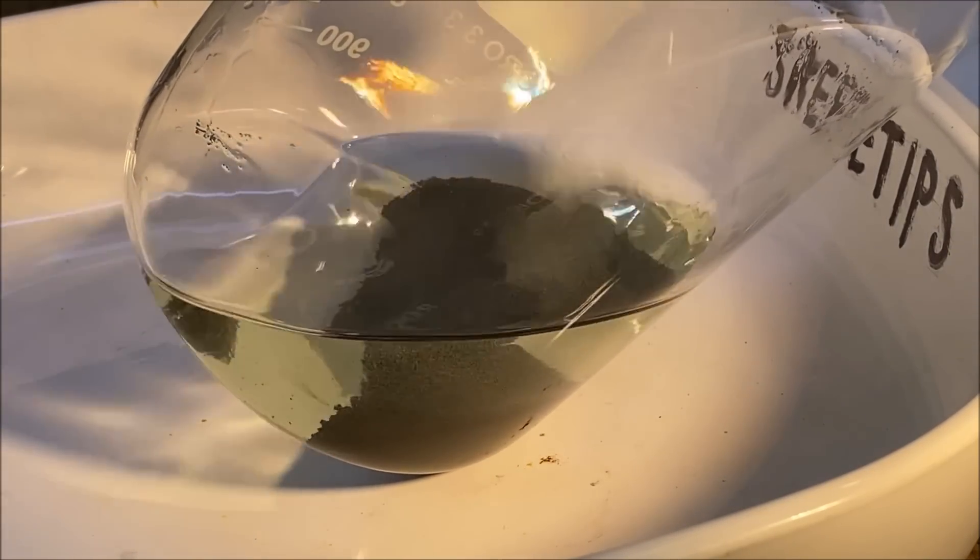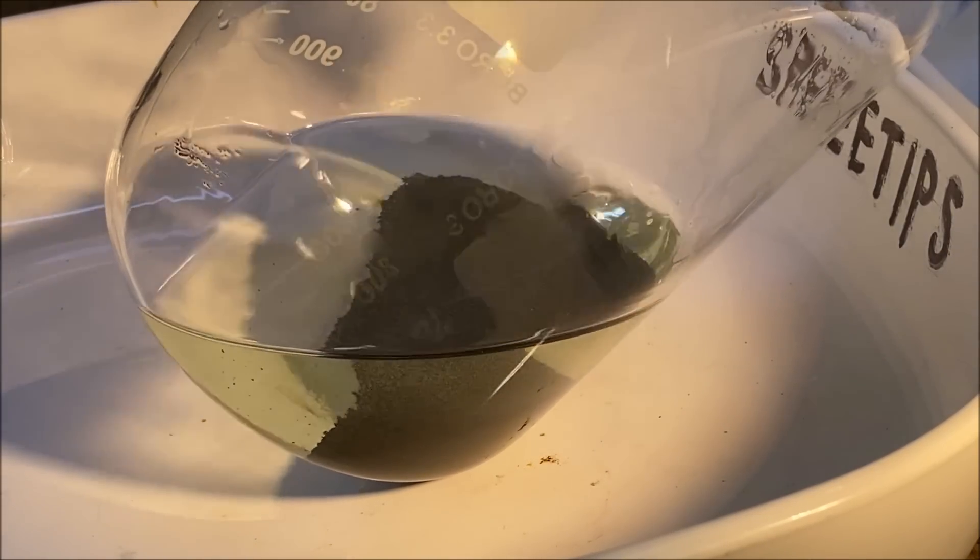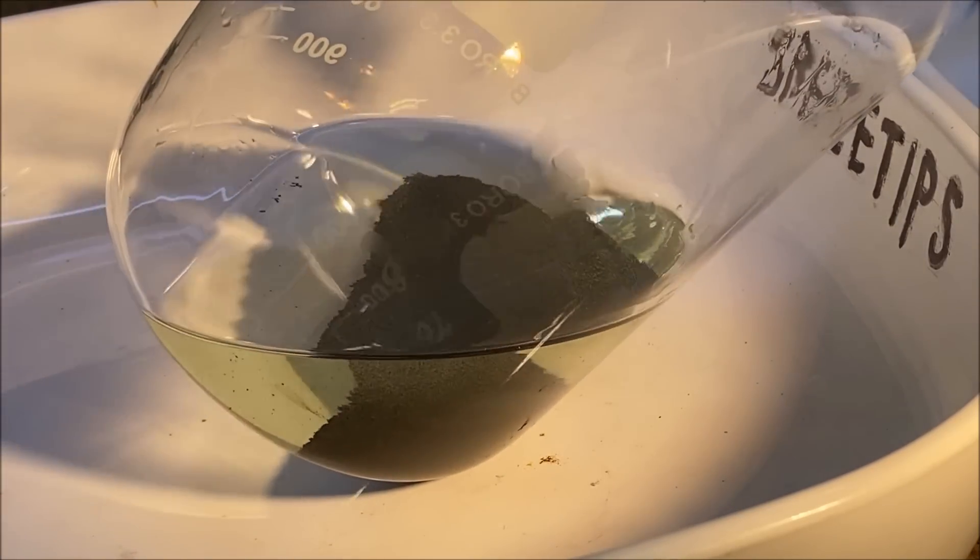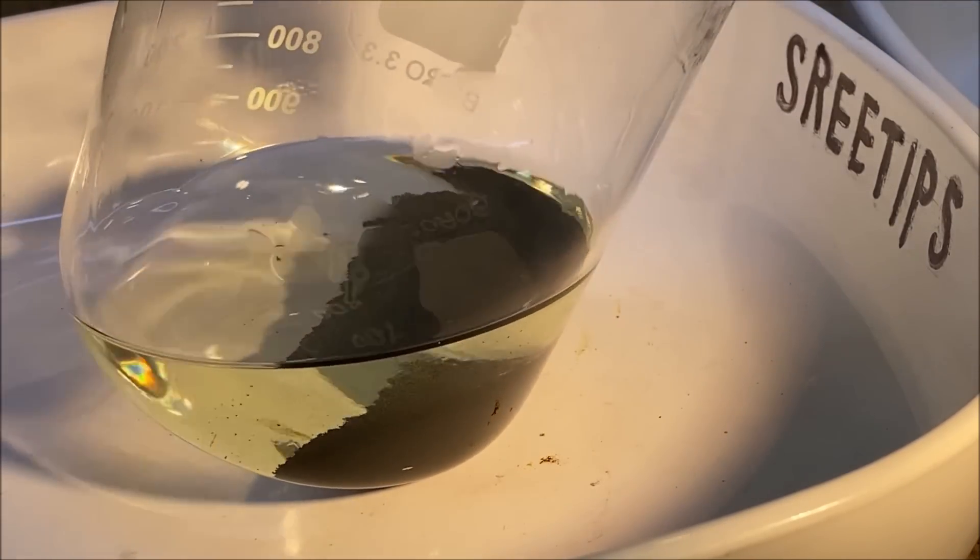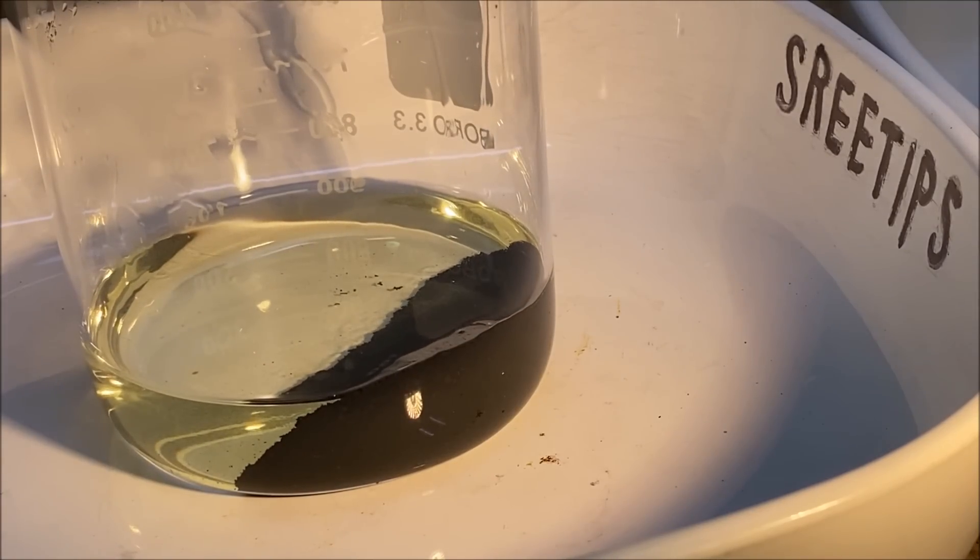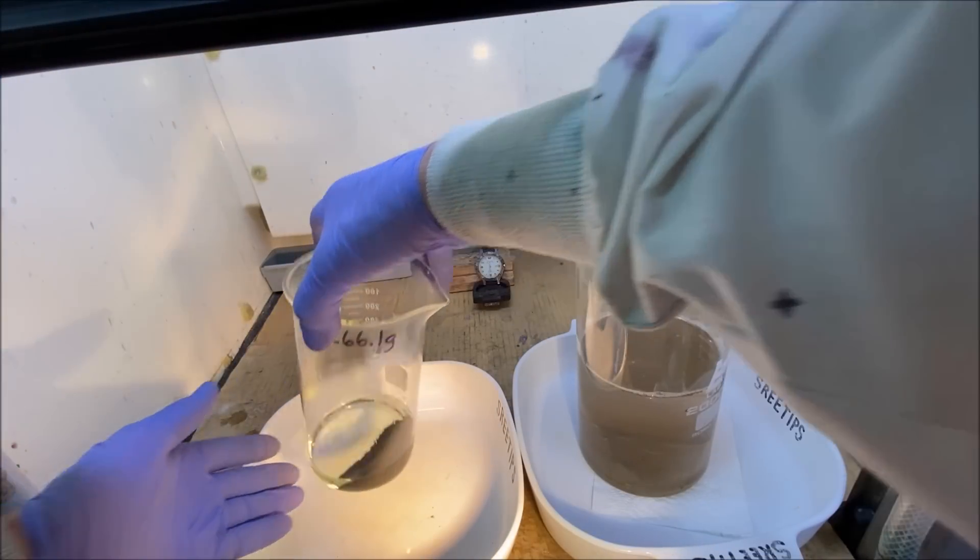You can see the color of the solution start to turn. That's because if you leave it set inside the hydrochloric acid too long, that finely divided black powder will try to go back in solution. Let's pour this off here.